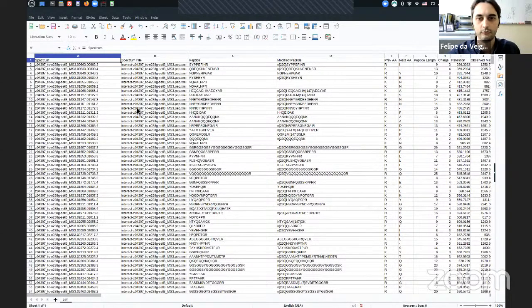I'm just going to go really quickly through the file itself, showing what kind of information we report here. You don't need to take notes or anything like that. If you miss anything, don't worry. We have on the website that we showed before, that Fengchao also showed again, all the columns of every file, on pages explaining what they mean and what kind of information they have.